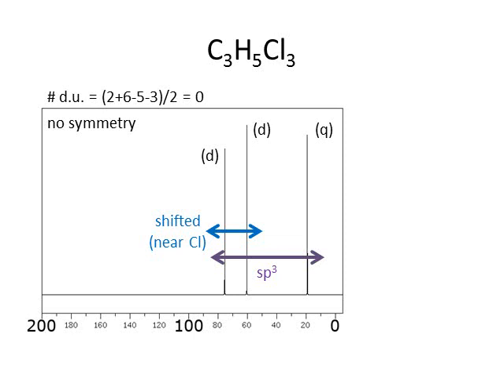All right, what else do I see in the spectrum? I see information from the splitting in the off-resonance decoupled. This one here is a Q. Q is a quartet. What does a quartet in the ORD tell us? Oh, CH3s give us a quartet. And so I know that this signal is a CH3. On the other hand, this one's a doublet, and this one's a doublet. What sorts of things give me doublets? Well, those are CHs.